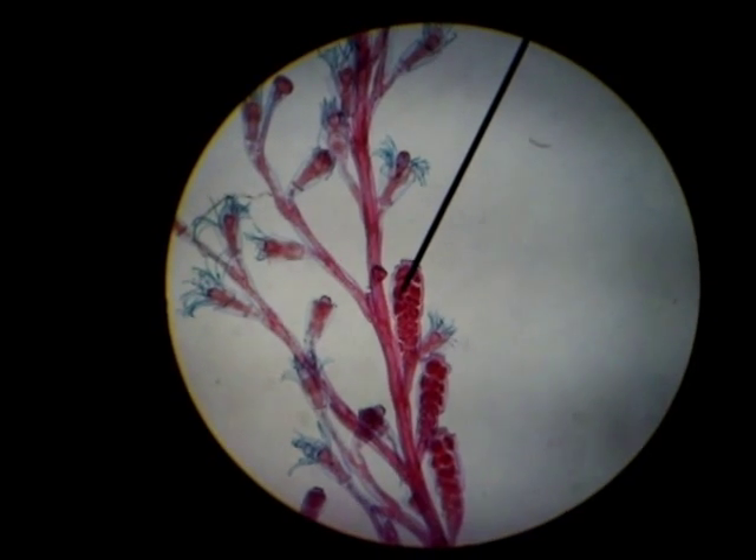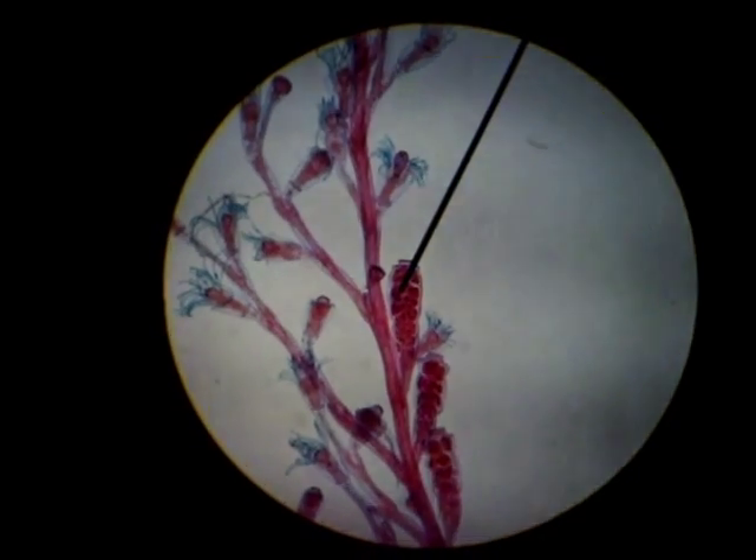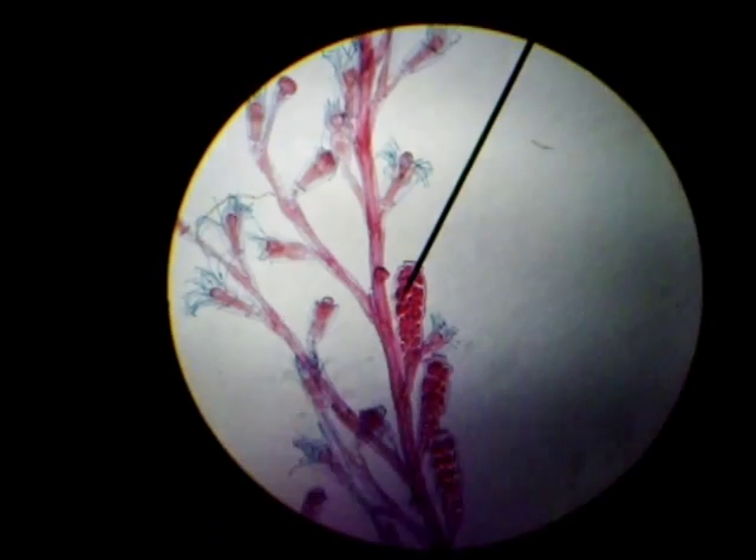That was Obelia, a colonial form of Hydra, Phylum Cnidaria, class Hydrozoa.